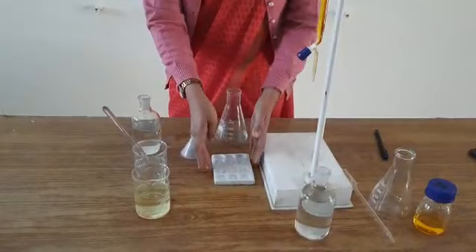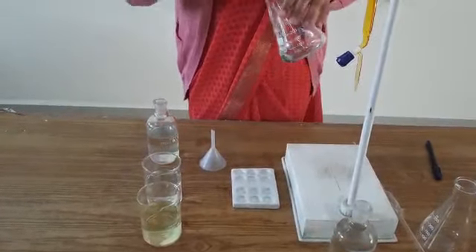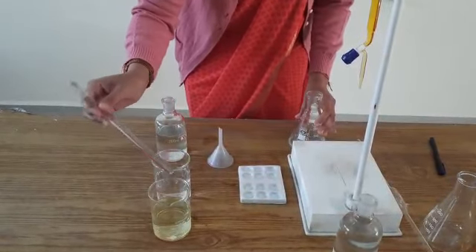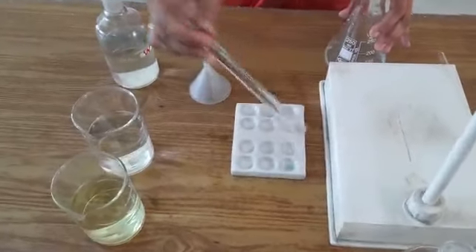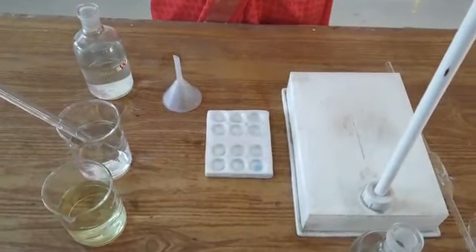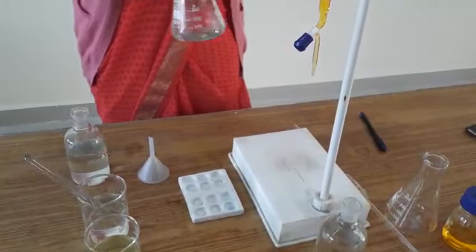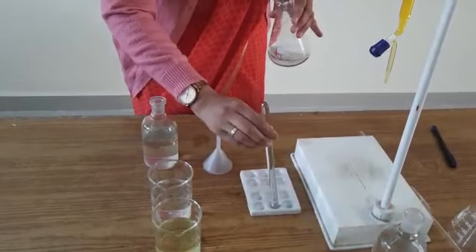I will use this porcelain disc and a glass rod. Through the glass rod I will take a drop of the reaction mixture onto the porcelain disc. I will wash it with water and then add a drop of the external indicator, potassium ferricyanide. As you can see, the blue color is present — this indicates that ferrous ions are still present in the solution. Let us continue the titration. After addition of another 1 ml, I will again check the reaction mixture for the presence of ferrous ions.